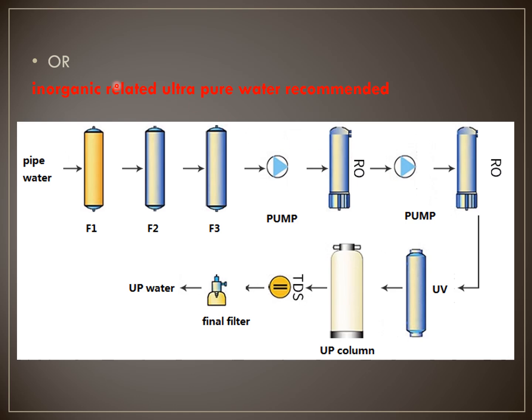If your research is more related to inorganic research, we recommend you install 2 RO with UV with ion exchange. Then this will still reach the same level, with resistivity over 18.